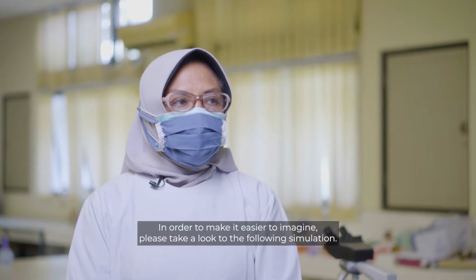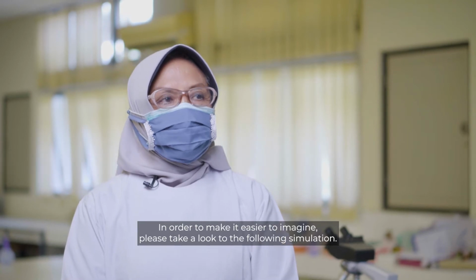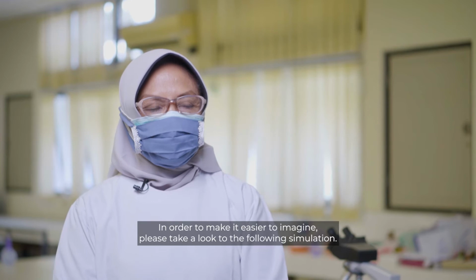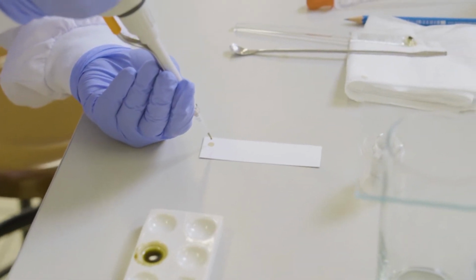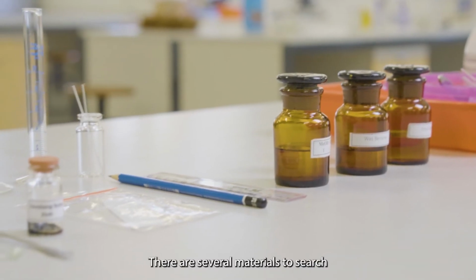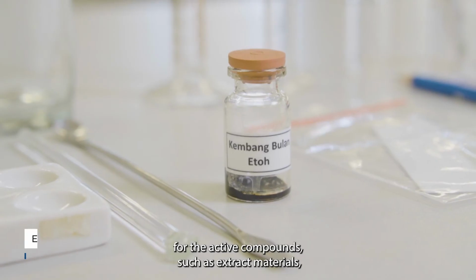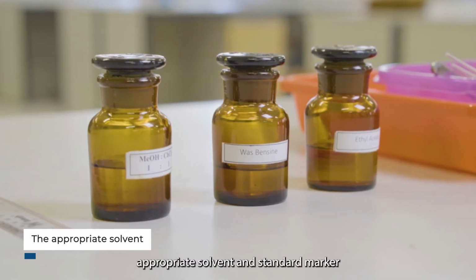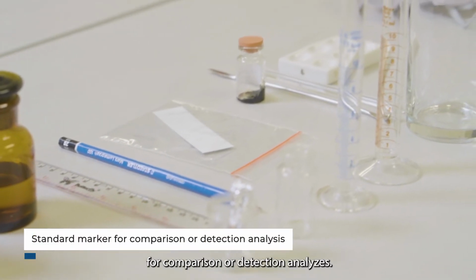Okay, to make it easier for you to imagine, please take a look at the following simulation. There are several materials to search for the active compounds, such as extract materials, appropriate solvent, and standard marker for comparison or detection analysis.